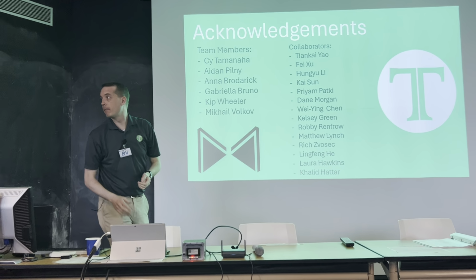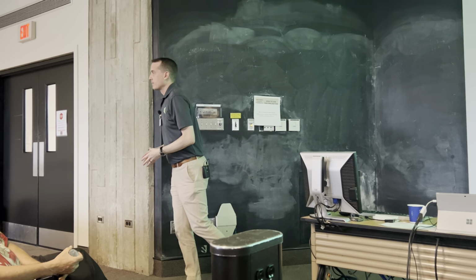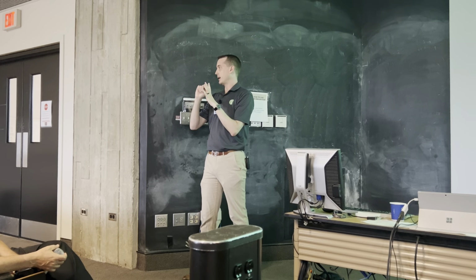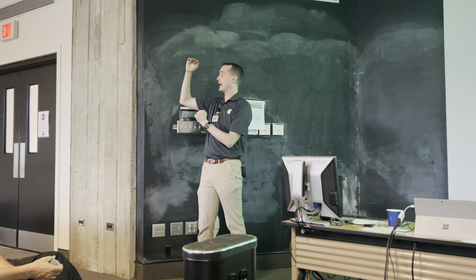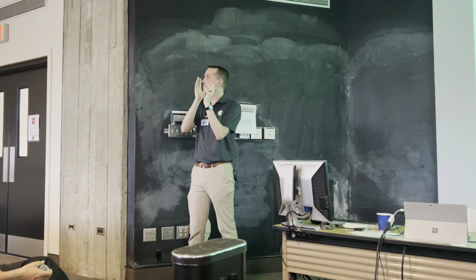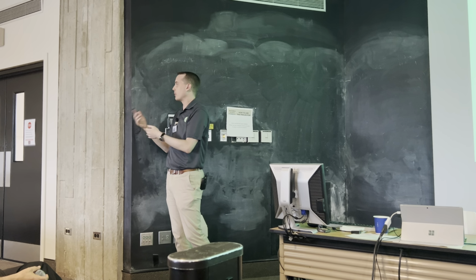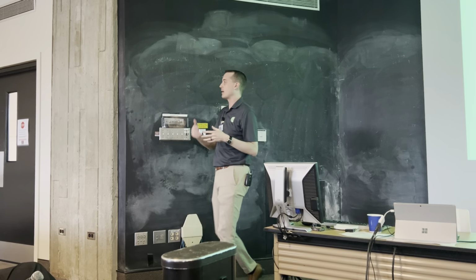Excuse me. When you said bias, what sort of bias are you treating in the machine learning models? Yeah, so the bias is coming from the user that's annotating the training set images originally. Right? Are they seeing the same thing? We saw that there are wide error bars between the users. So what bias is there, and then how does that propagate into the models? And then how much bias can we tolerate in order to get to the answer that we ultimately want, which is is this a good material or a bad material, based off of the metrics that we're looking at.